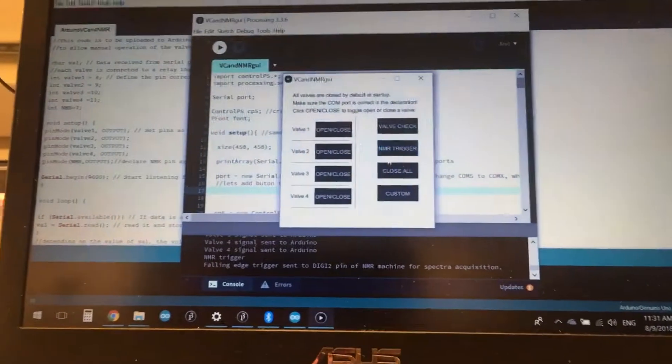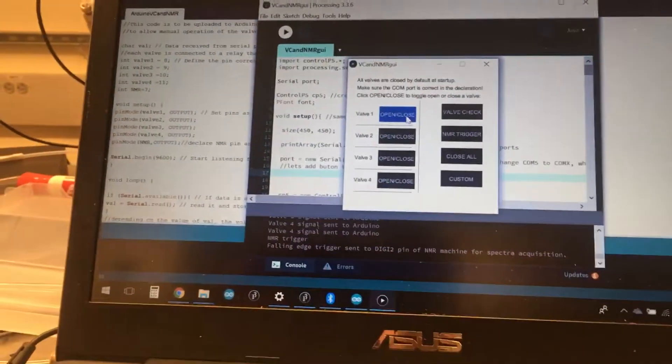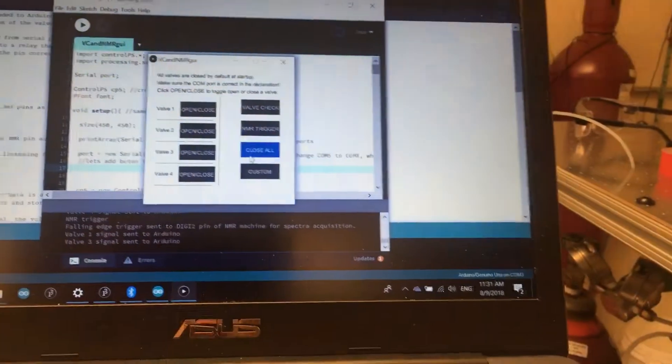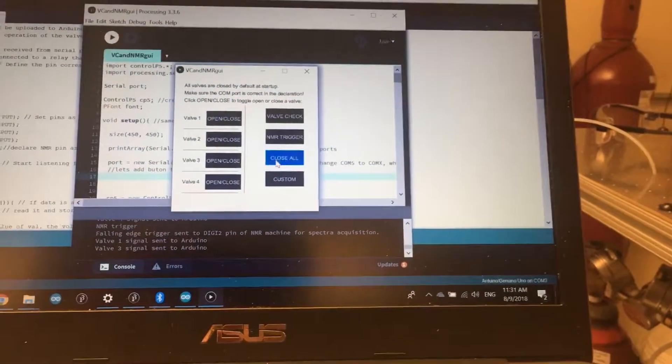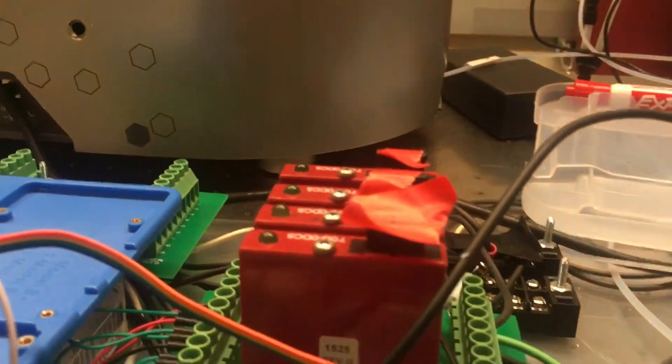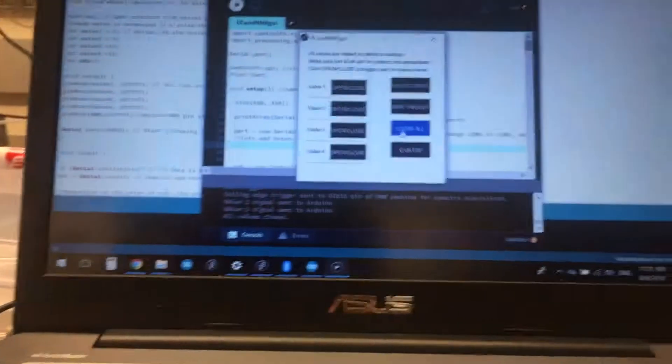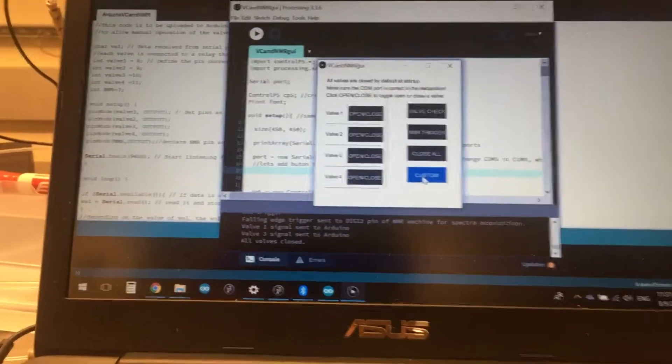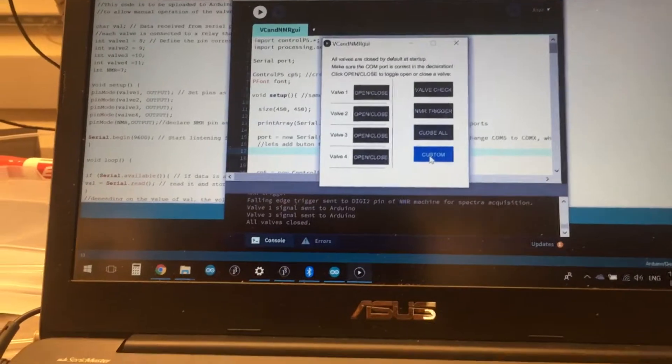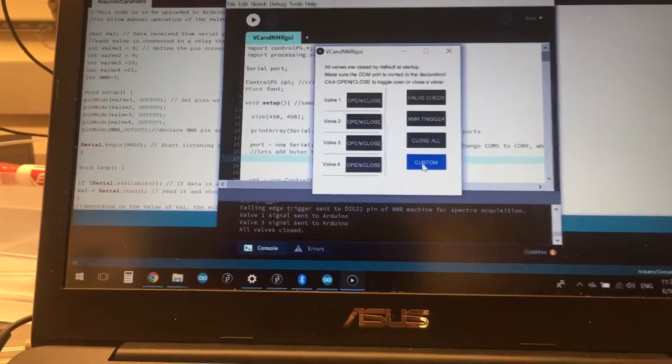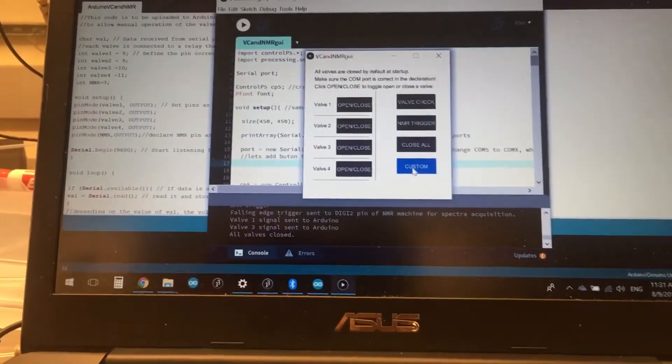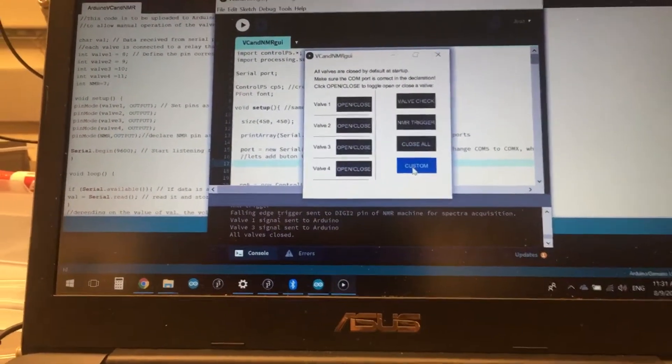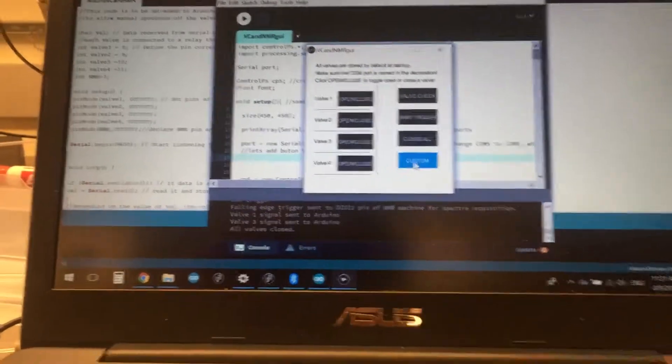We also have a close all button, so if we have an emergency happen and we have valves one and three open, for instance, and we need to close all of them, we can just click close all and it will close all the valves for safety. We can also have custom functions here, which we can define whatever we want by rewriting the callbacks.